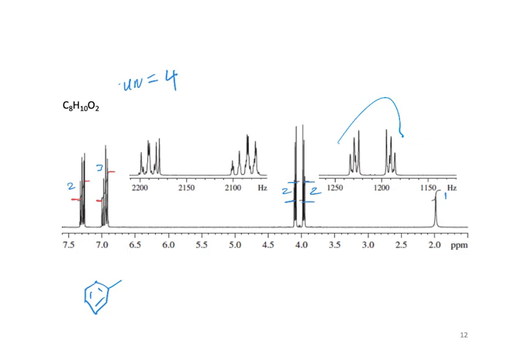And we have 2 oxygens. But what do you think these are? So they integrate for 2 and 2, and they have all this splitting, and they're angled like this. Is it an ester? No, it can't be. Diastereotopic, right? Well, they're 2 and 2, though. I think it's just a CH2 and a CH2.